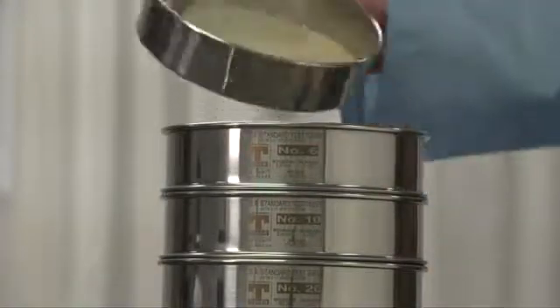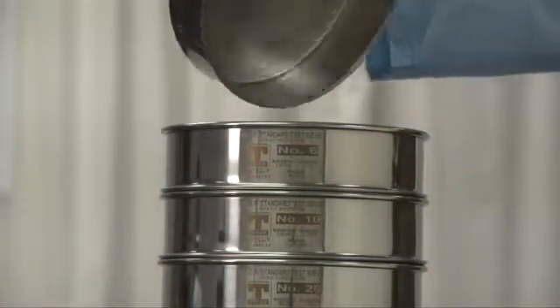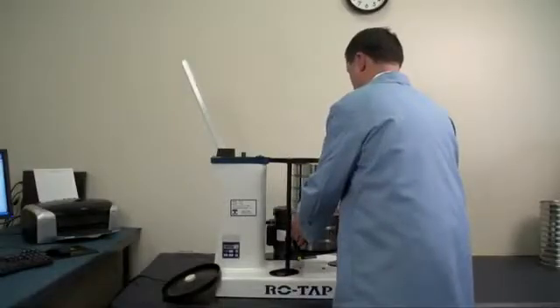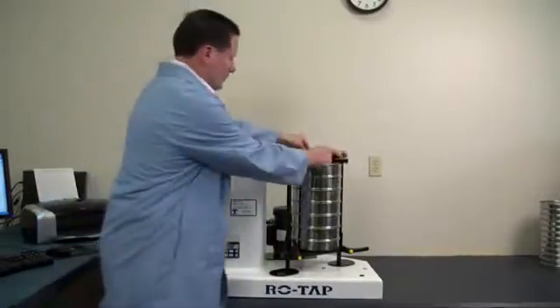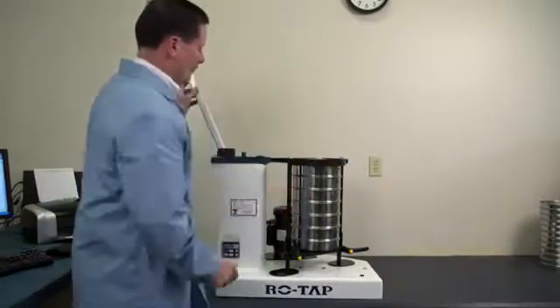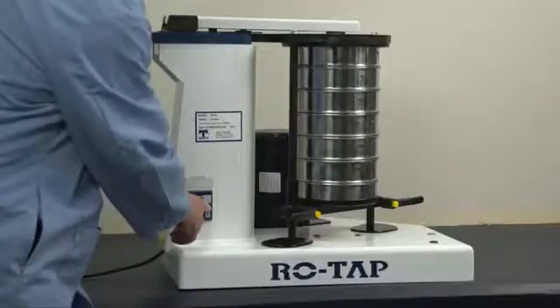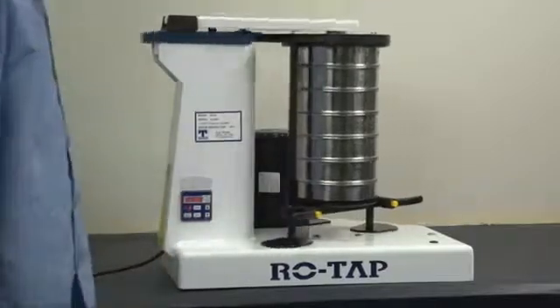Empty the entire sample into the top sieve of the stack. Make sure that you do not overload any sieve, as this may cause blinding. Place the stack into the sieve shaker with the cover on the top sieve and securely fasten the stack into the shaker. A sound enclosure cabinet can be used to reduce operating noise levels. Set desired time limit and start the shaker. Again, the time limit is generally an instruction included in the product specification.